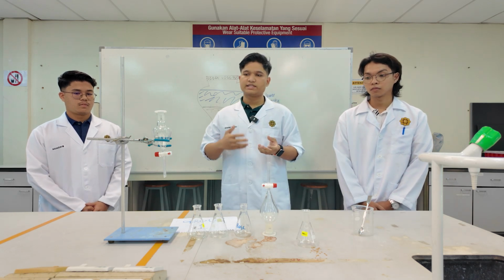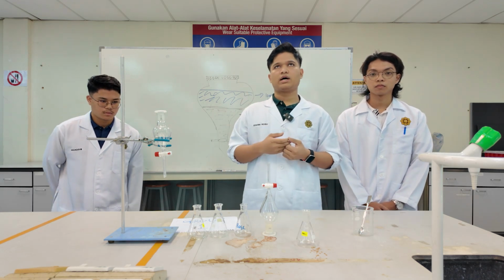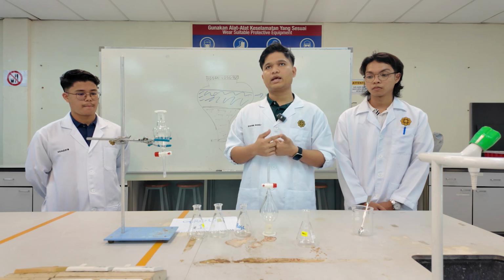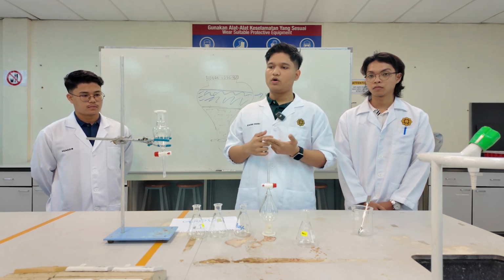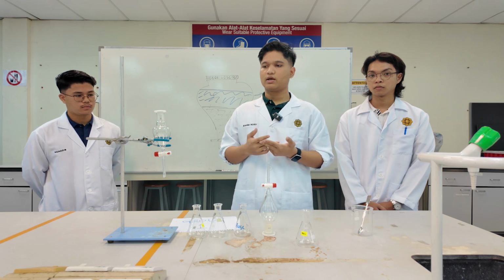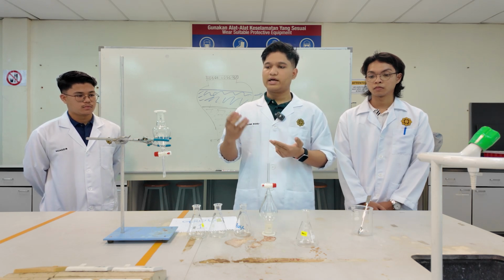So in this experiment, we start from a mixture of acid, neutral, and also base. We want a pure form of each in the extraction.